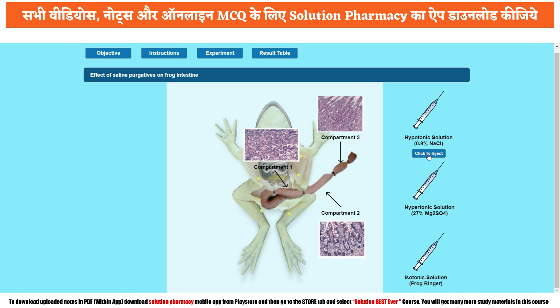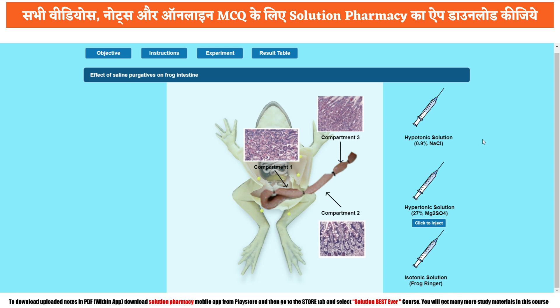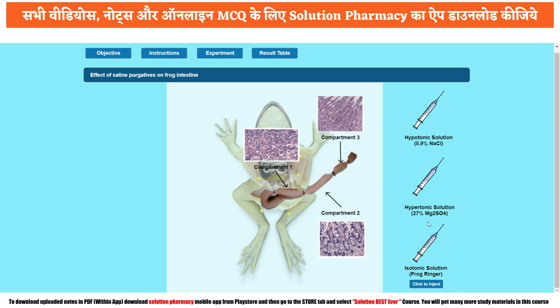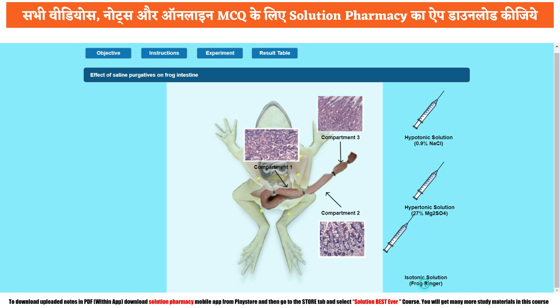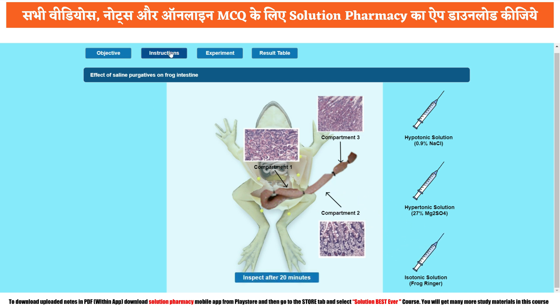Hypotonic solution means the solution having a lesser concentration of the constituent compared to the reference. Hypertonic means having a larger concentration of solute. Isotonic means its concentration is equal to the compartment where we are placing it. Now click these injections one by one and they will automatically be injected into the respective compartments. I'm clicking the first injection containing hypotonic solution into compartment one, second hypertonic solution into compartment two, and isotonic solution into compartment three.